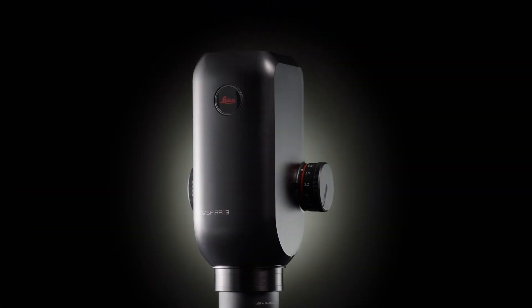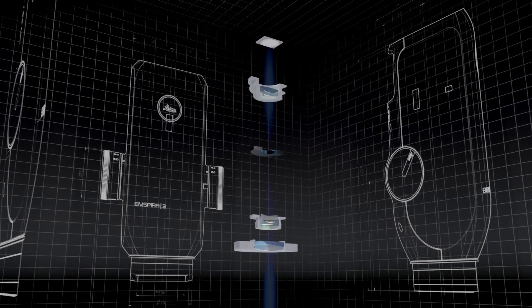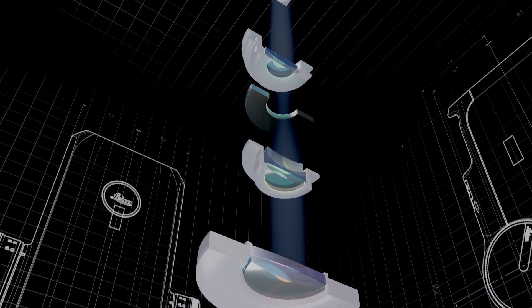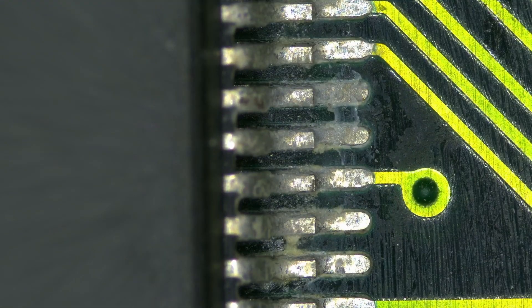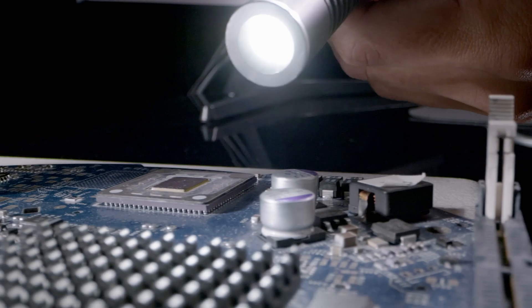The Emspira 3 is designed for robustness to maximize uptime. At its heart beats proven Leica high-quality optics with a zoom range of 8 to 1 and a 4K sensor, for top-of-the-line image quality. I mean, it's Leica Microsystems. What else do you expect?